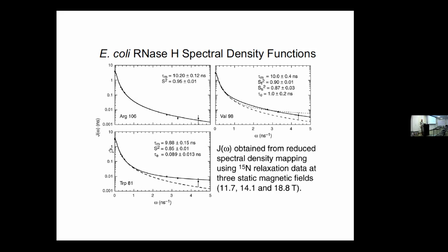And to get below, I think this data was probably 500, 600, 800. For a decent sized protein, going below 500 megahertz is pretty hard because of resolution and sensitivity. And the only solution is to do relaxometry, where you move the sample to lower field. You polarize at high field, go to low field for relaxation, and then come back to high field for detection. And we have a sample shuttle here on the 700 that can do that.